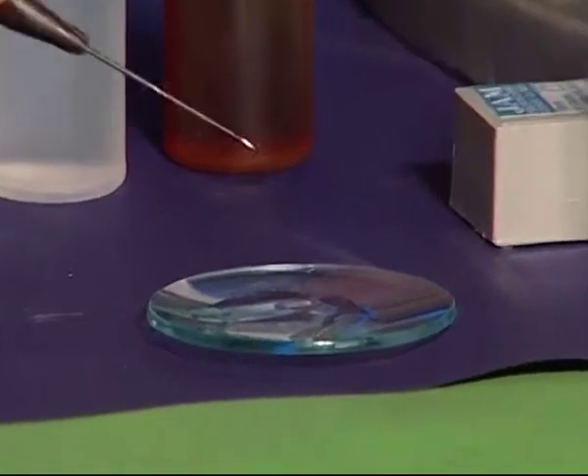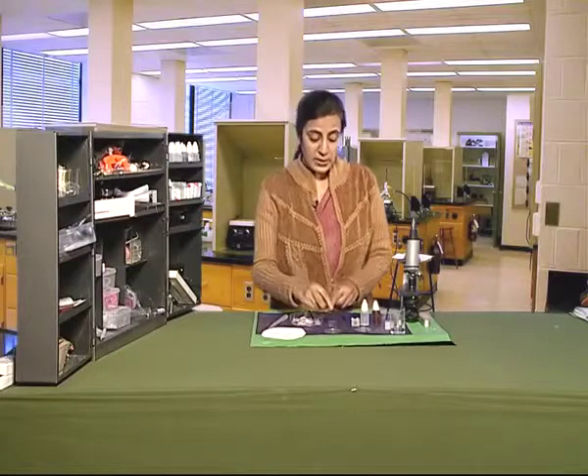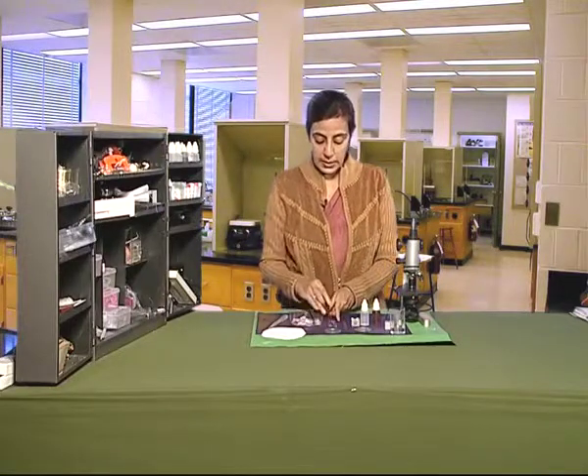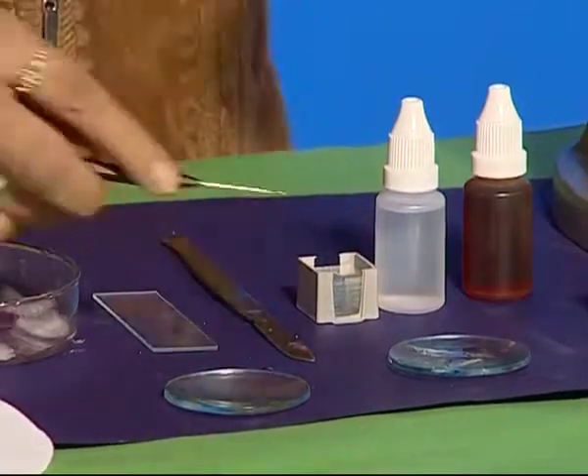Put it in water in the watch glass. Now, transfer this peel onto a glass slide very gently and carefully.